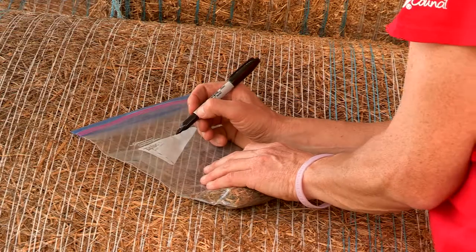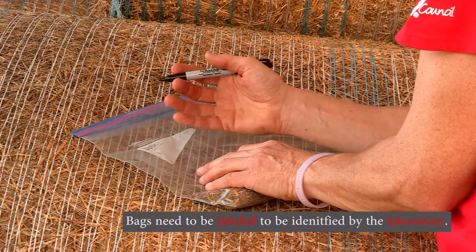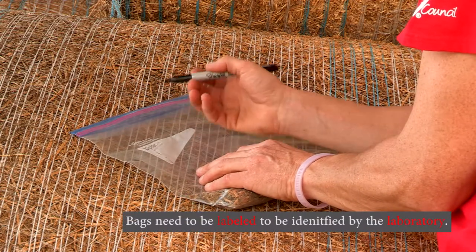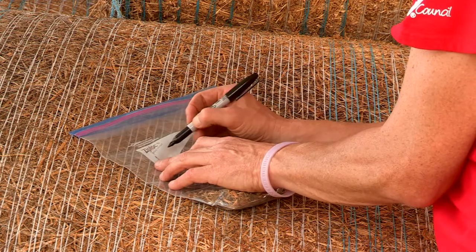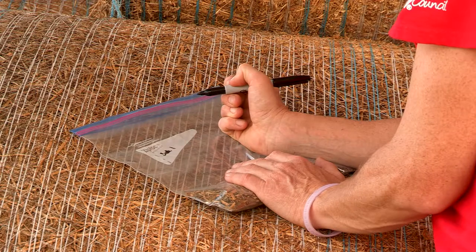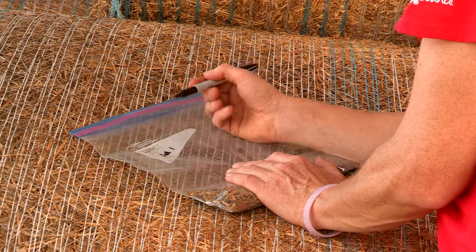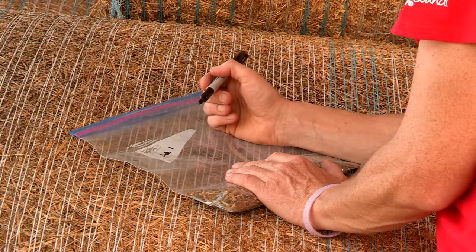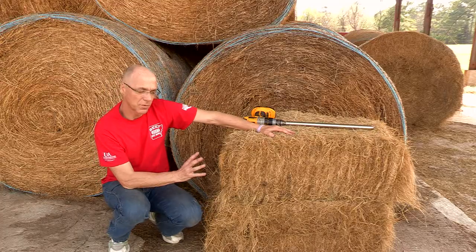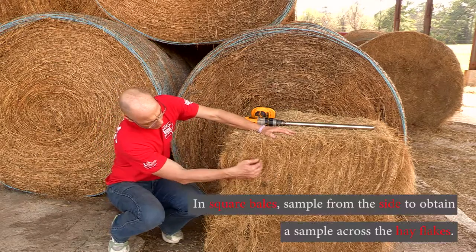One important thing to remember is to label the bag so you know which lot or set of hay bales the sample came from. Just label it — for example, 'Bale 1' — and make sure that label is on the bag when you send it to the laboratory so they can identify your samples.